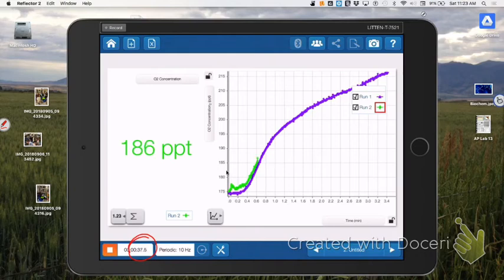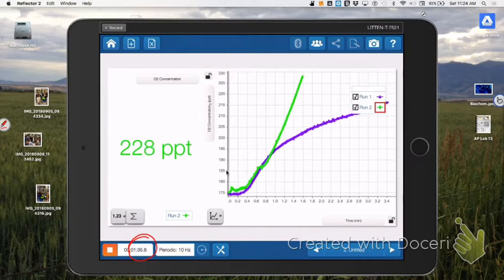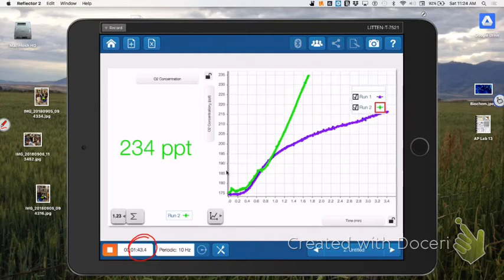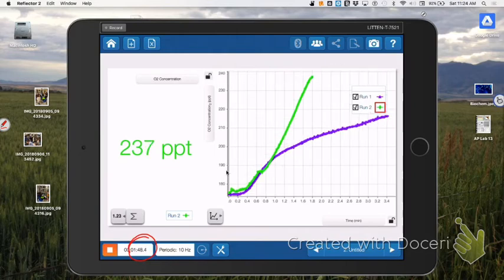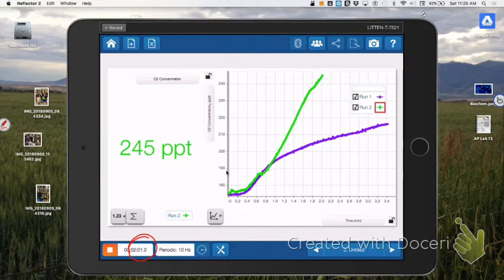Go ahead and pause the recording for just a little bit. We'll let some of the time go in our experiment. As you can see now, the experiment has run for 1.5 minutes, and the graph is automatically adjusting itself to what it needs on the axis. I'm making sure again that the stopper is not on there too firmly, otherwise it will pop off. I just wanted to be able to read the change. Doesn't have to be a vacuum, right? Because you know the pressure would build up if you sealed it entirely.